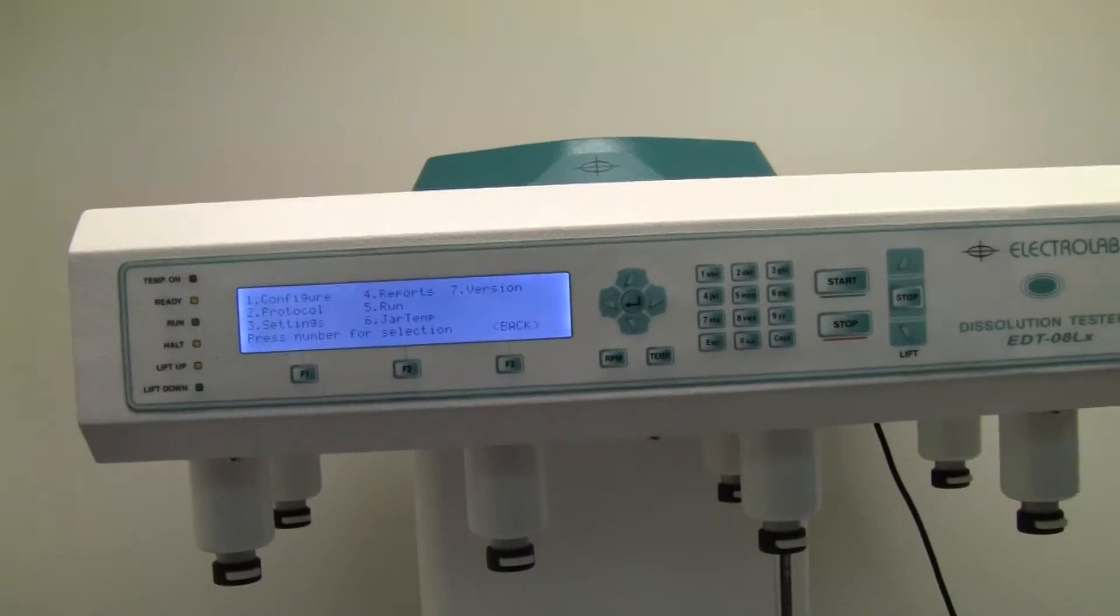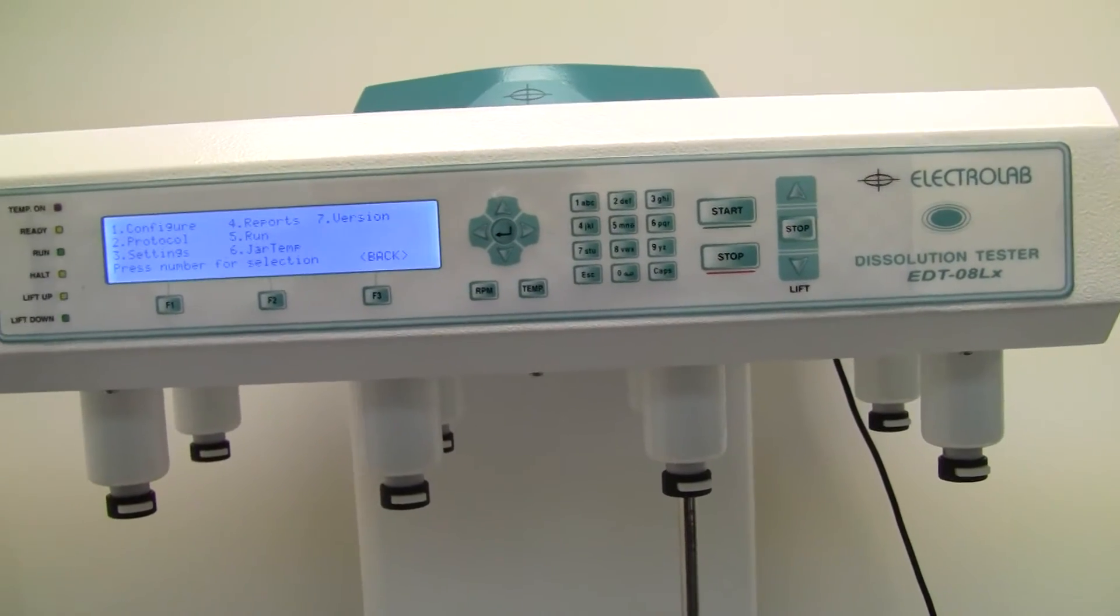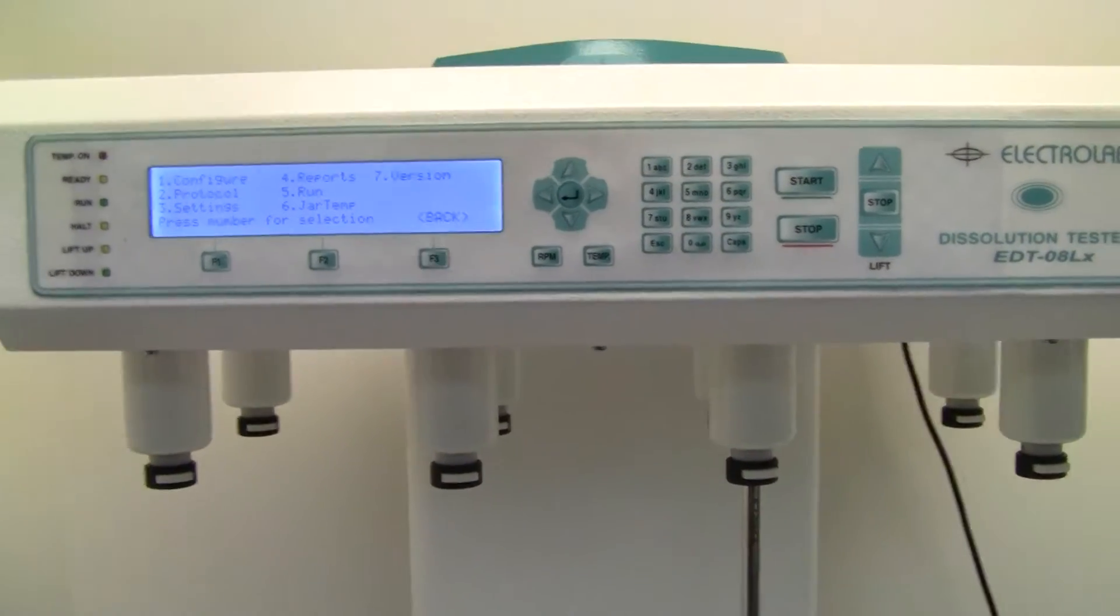The unit can be set up to run as a standalone, or with a computer, or in a cloud environment, which I find very nice.